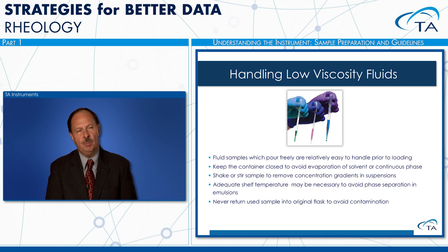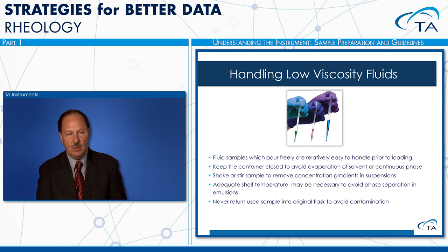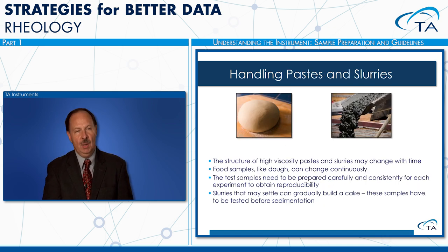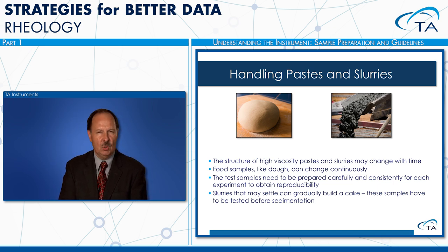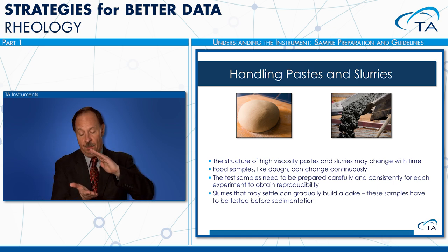We'll talk about some loading techniques with these low viscosity fluids as well. One thing that we mentioned here is you don't want to put any material back in the container, just to avoid any kind of contamination. Sometimes things like pastes and slurries can offer some unique challenges to getting a good rheological characterization. So if you have something like dough, you might want to think about using the parallel plate, maybe with the cross-hatch geometries top and bottom.